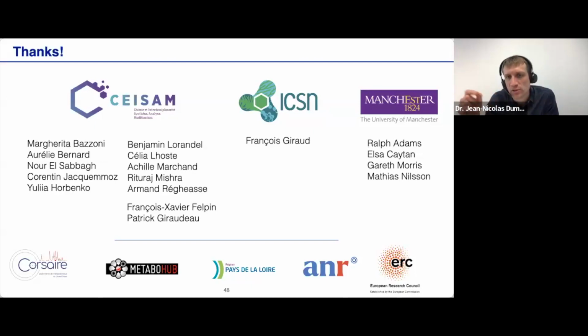And one has to preserve that contribution because that's what the entire experiment relies on. And if one does the calculation for a sample that is moving and tries to eliminate all of the v term, then somehow, for, as I understand it, symmetry reasons, that term of interest that one is trying to design is also suppressed. Yes, that's what I'm facing, but hopefully I'm wrong.